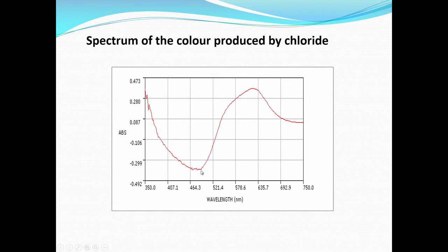Okay. Around 490, between 460 and 490, absorbance does not change much. Okay. So, that is how we fix the wavelength. So, the absorbance should not change much. So, even if there is an error of wavelength by about 5-6 nanometers, you can see that the absorbance is not changing much here at all.